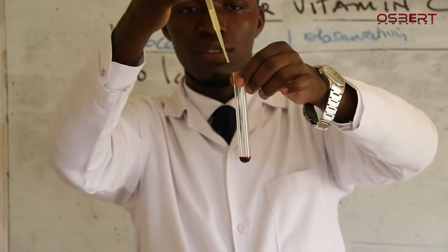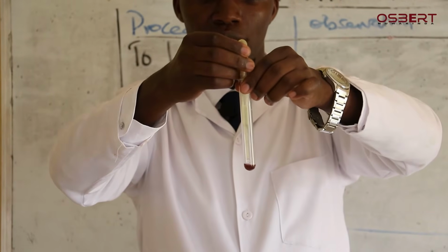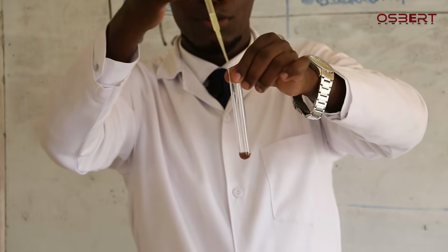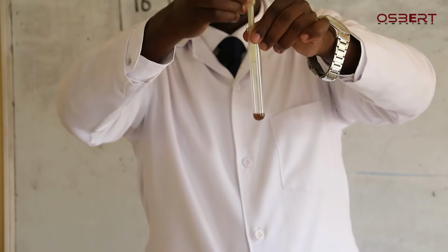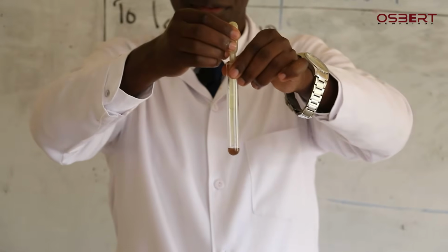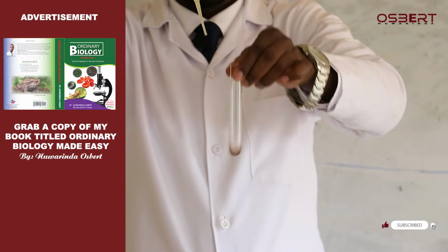3 drops. 4 drops. 5 drops. 6 drops. 7 drops. 8 drops. 9 drops. 10 drops. 11 drops. 12 drops. 13 drops.